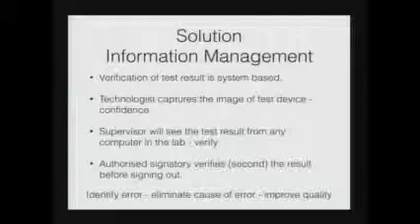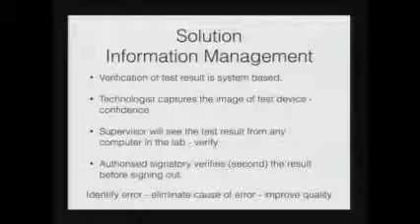I introduced this concept for the pregnancy test purely because of that error. But when I was explaining this to my staff, they were very happy, and they said they'll start capturing images of blood group, tube tests, card tests, cultures, culture plates, and the image management solution became a very sustainable activity in our lab.